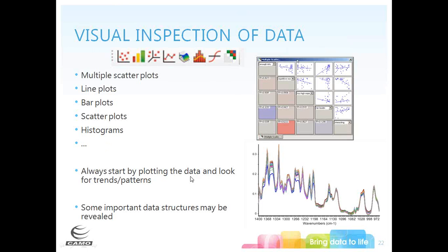We can also, during the visual inspection of our data, see if we have any outlying data or perhaps some mistakes that we'd want to correct before moving forward in our analysis.